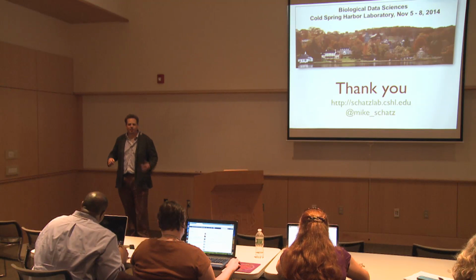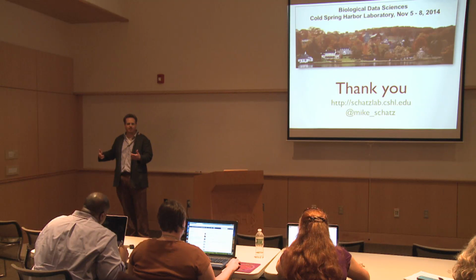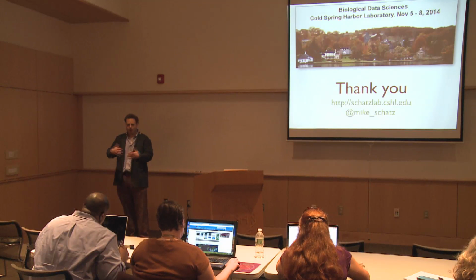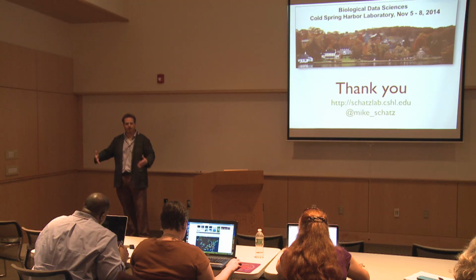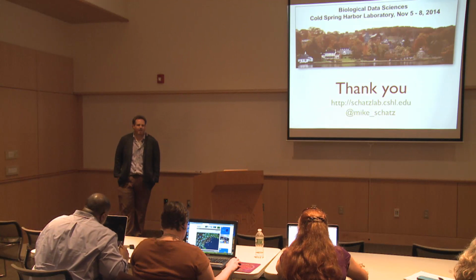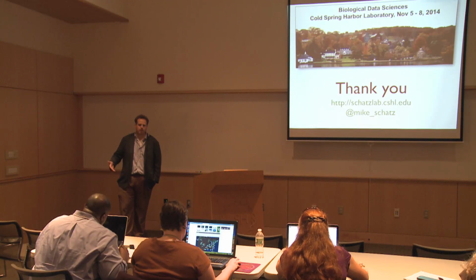We take the Illumina reads, do some pre-processing, map them to the erroneous PacBio reads, do error correction of those, and then assemble the PacBio reads on their own. We've done that now in microbes, yeast, rice, up to human, and get really good results.